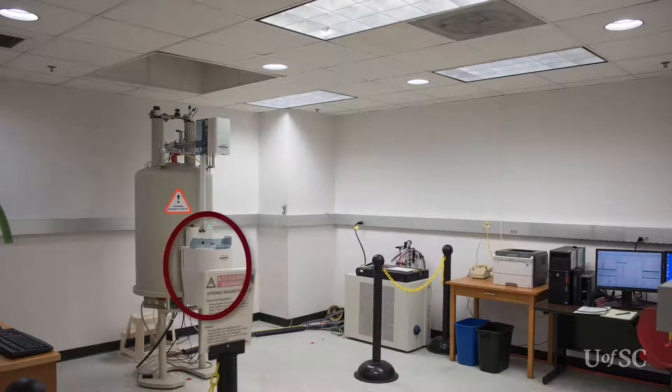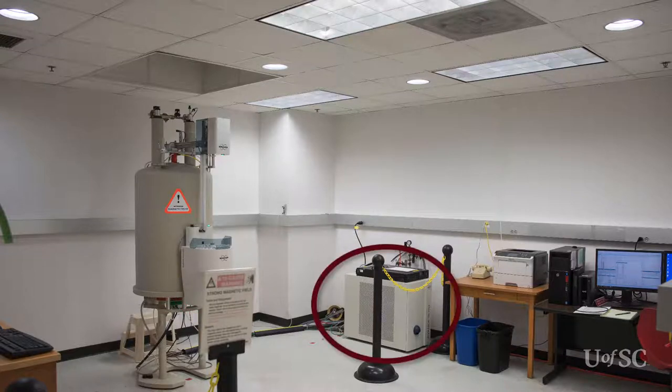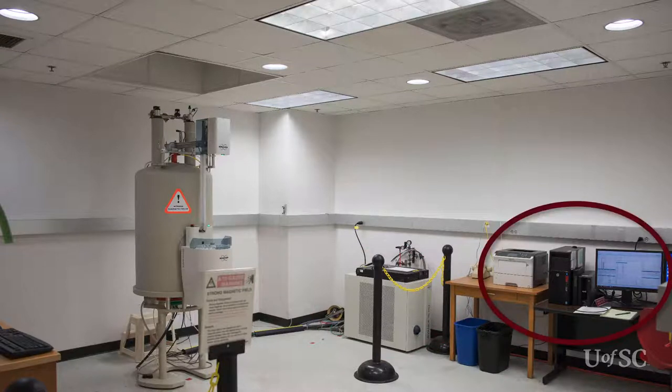Attached to the front of the magnet is an automated sample changer. This allows for queuing of samples and full automated and unattended operation. To the right of the magnet is the NMR console that produces radio frequency excitation pulses and processes the returning NMR signals. A computer workstation running dedicated software is how the user interacts with the instrument and the data it collects.